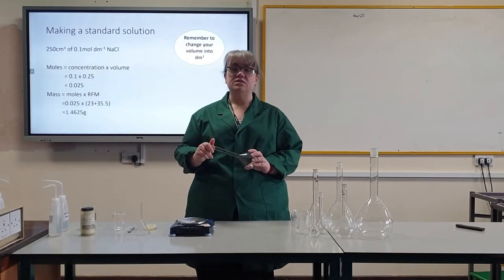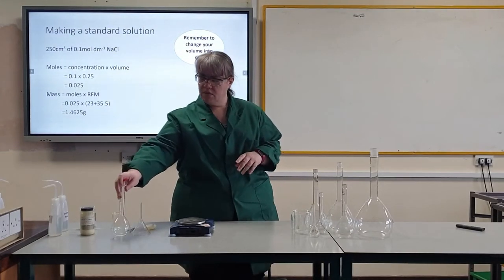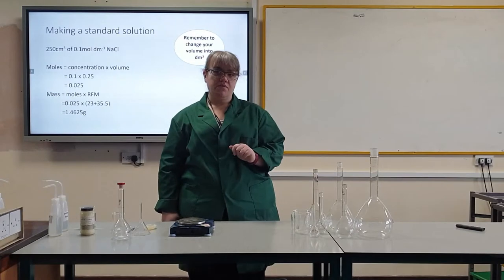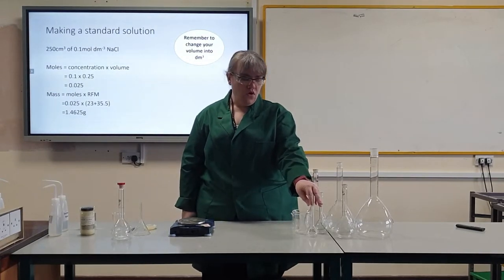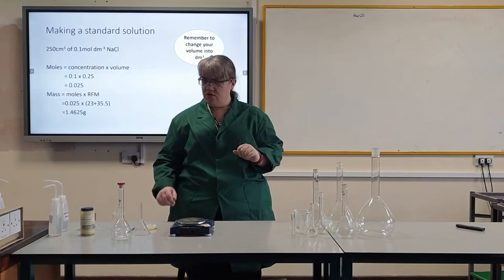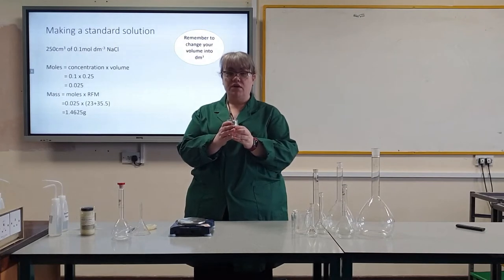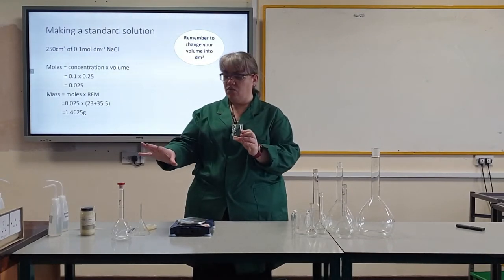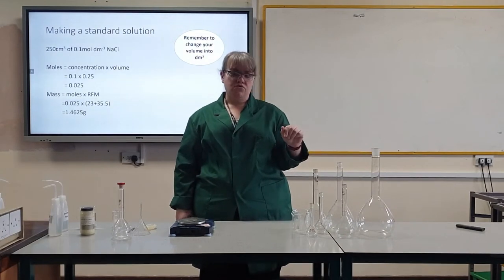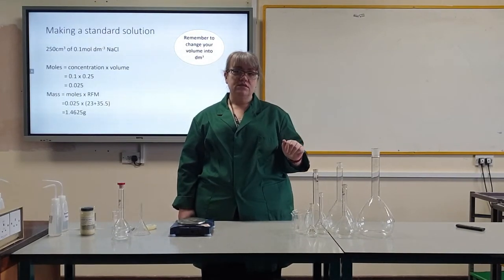I am making 250 centimetres cubed of solution, so I have a 250 centimetres cubed volumetric flask. The volumetric flask must be the volume that you wish to have at the end. Volumetric flasks come in many different sizes — I have a 50 all the way up to a 2 decimetre volumetric flask. When choosing the beaker, use a size appropriate to your flask. I have a 100 centimetres cubed beaker to do my dissolving. When it comes to volumetric flasks, size matters.